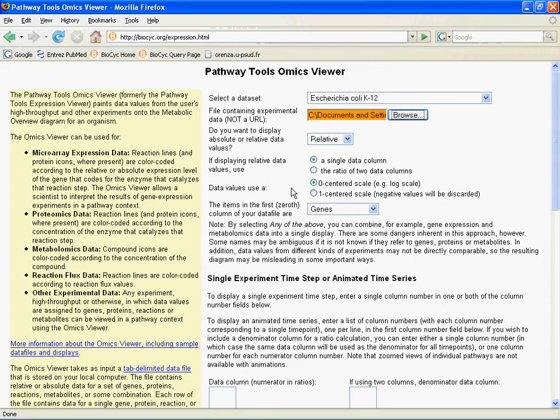Then for data values, you can use a zero-centered scale — that's a log scale — or a one-centered scale. The zero-centered scale assumes log data units, so it can accept negative numbers. A one-centered scale won't accept negative numbers. You'll want to remember to pick the right one. If you pick the wrong one that doesn't match your data set, I'll show you what you can expect to see if you make that kind of entry error.